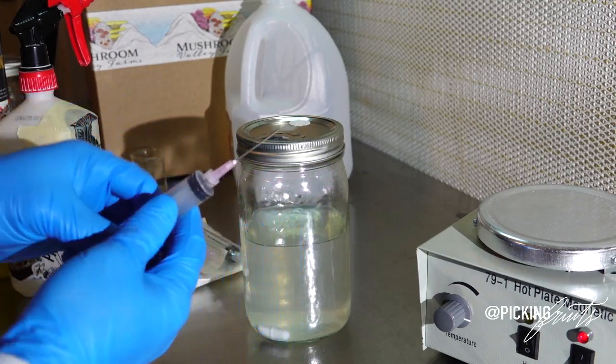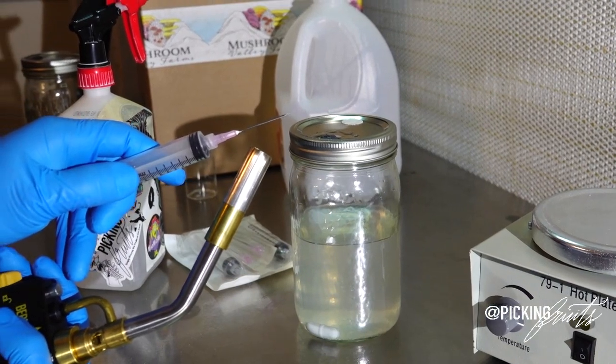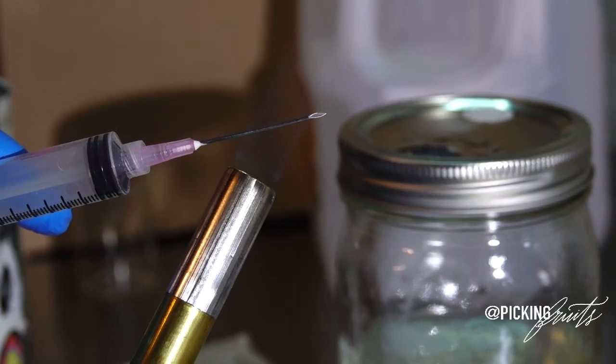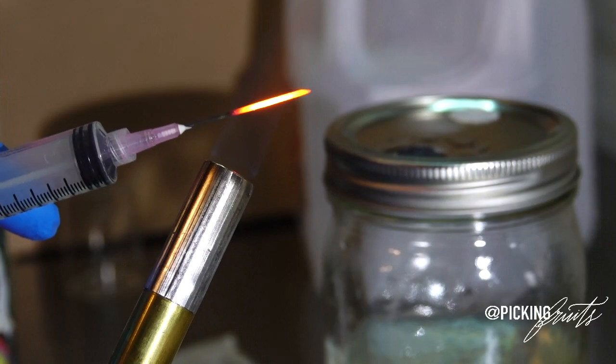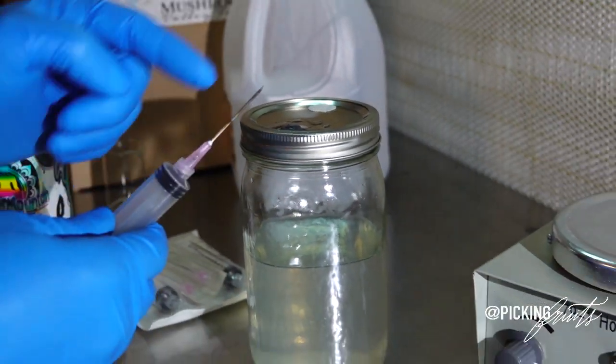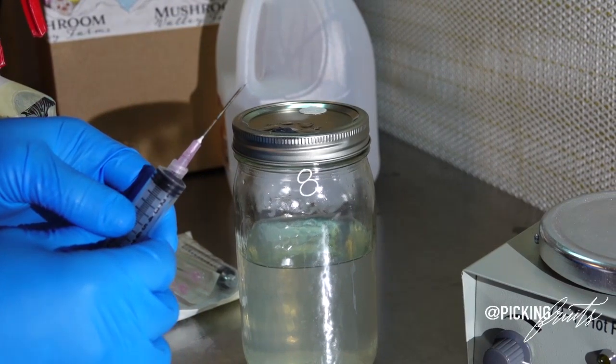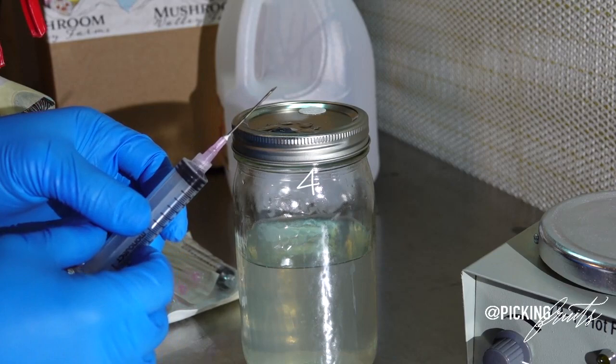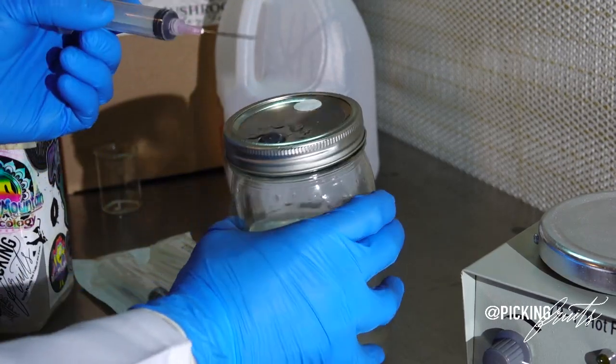So using a clean needle and syringe, I'm going to do the same thing. I'm going to flame sterilize it for two seconds. And in this case, we have nothing inside of the syringe to actually cool down our needle. So we are going to wait a few more seconds until it is not red hot anymore. And we'll just count down from 10, 9, 8, 7, 6, 5, 4, 3, 2, 1. And it should be cool enough at this point.